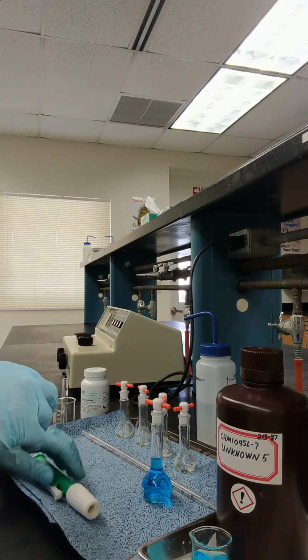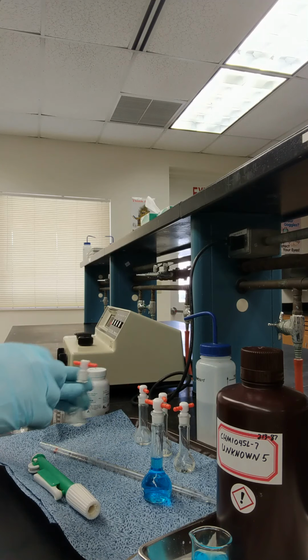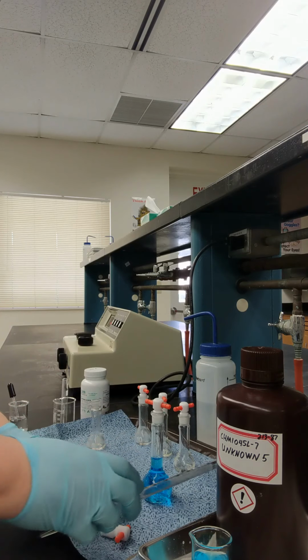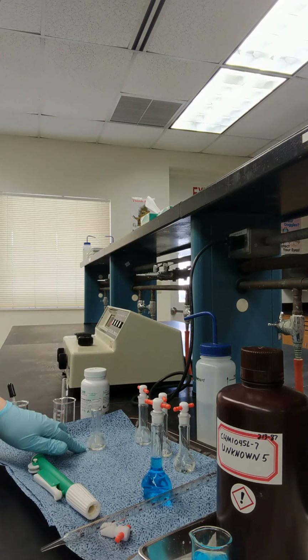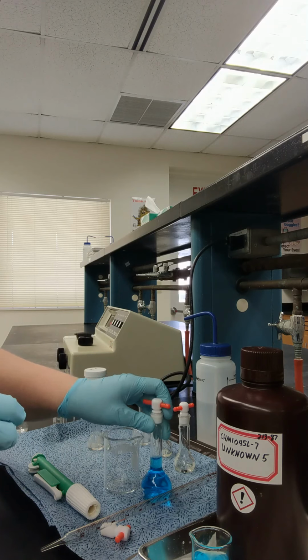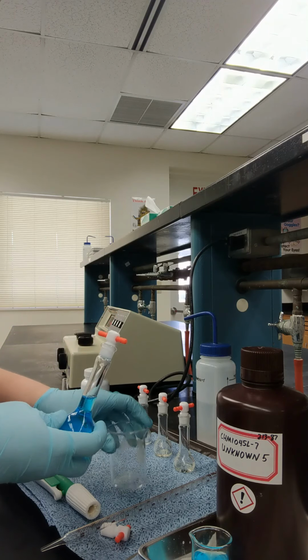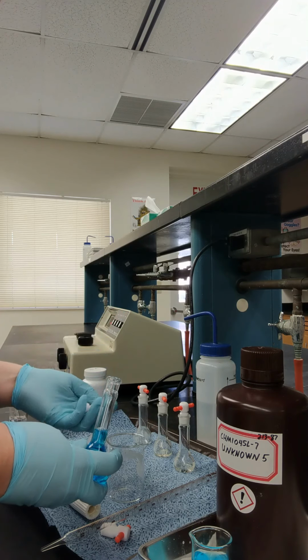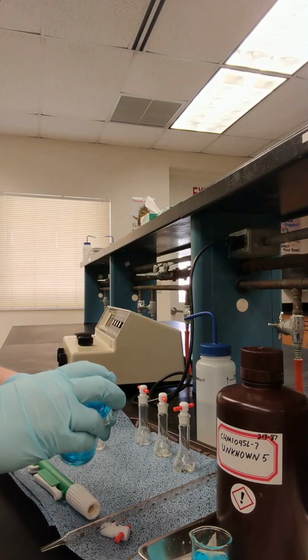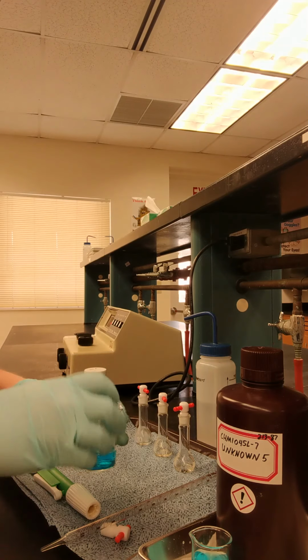So that's my stock, and I have here the pipette that I'm using to take the volume from my stock solution and to transfer that volume into the volumetric flask that I'm going to be using to prepare the standards. I'm going to transfer my solution from the volumetric flask into a beaker. It will be easier to take the volume from the beaker using the pipette.